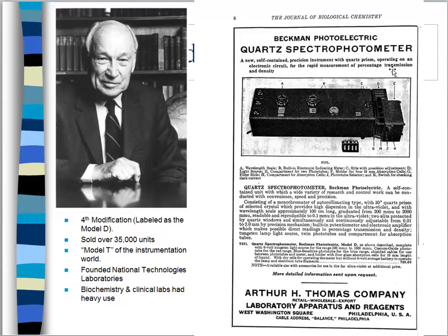And this transmission term is also very important. We have come further than transmission nowadays, so we don't really look at transmission anymore, but it's still a setting that I have on any UV vis spectrometer that I can use, but we just don't really measure transmission. But this was the first kind of go-ahead, right?